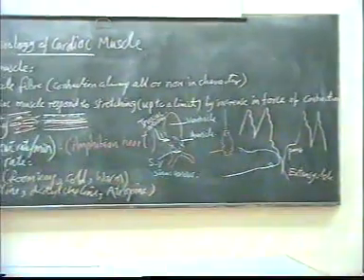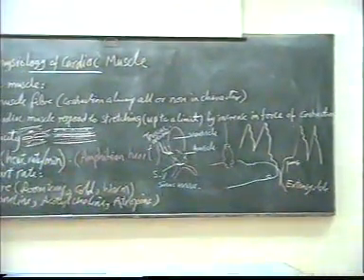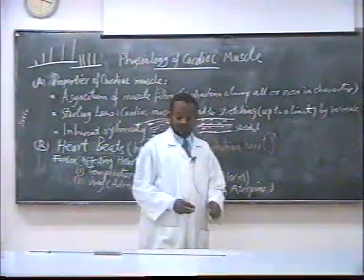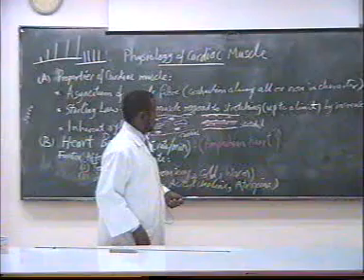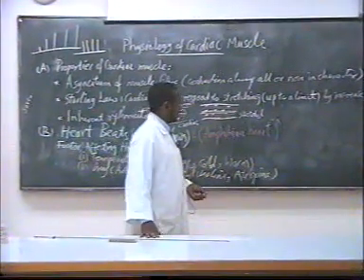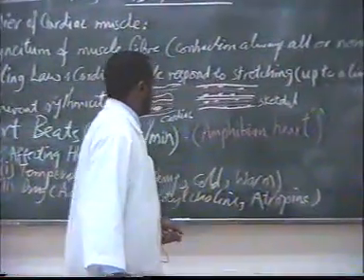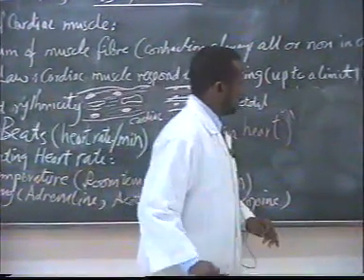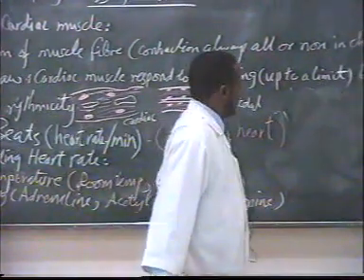The force of contraction and the rate of the heartbeat reflect the biochemical surrounding of the heart.